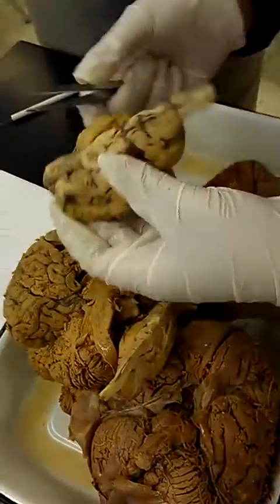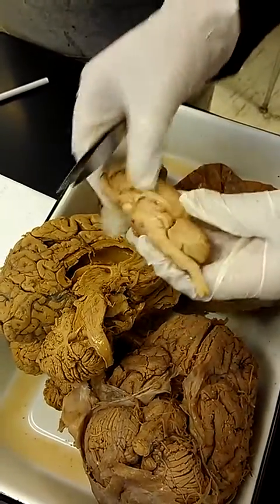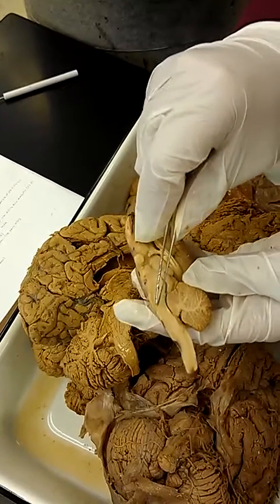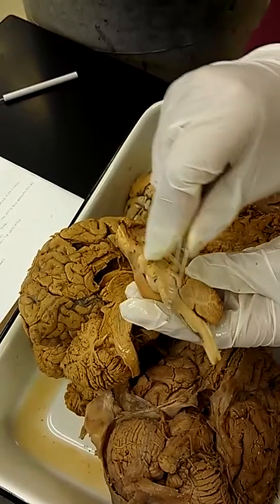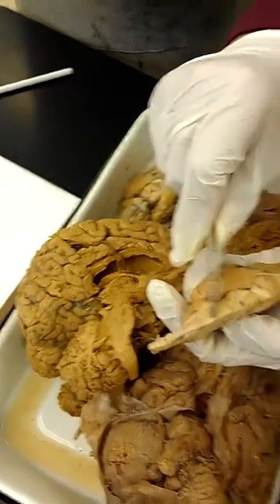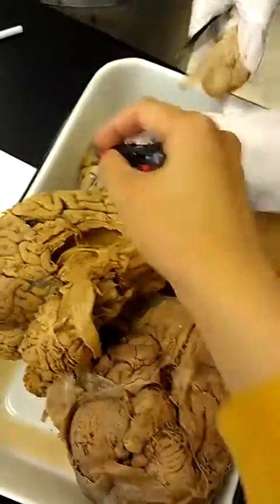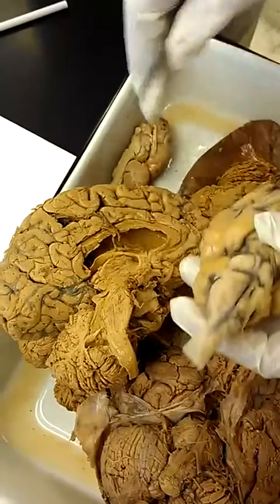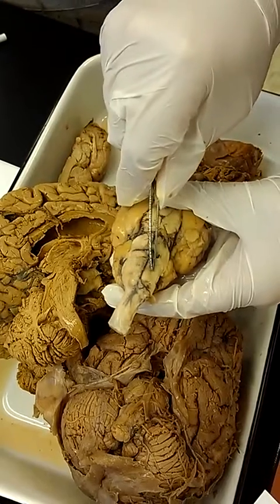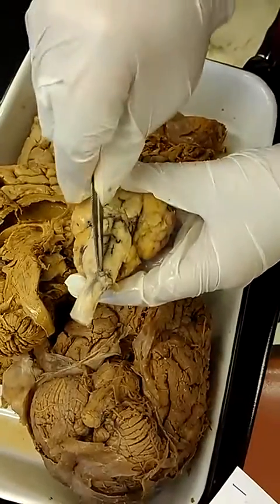Okay. Then the pons. If the laptop gave us this picture right here. The pons is the first bulge that comes off of the stem. So that would be right here. And then when we go down further, below it is the medulla oblongata. It's this one right here, the pons. And then right here is the medulla oblongata. And then the ventral fissure is just the line going down the middle of the medulla oblongata right here.